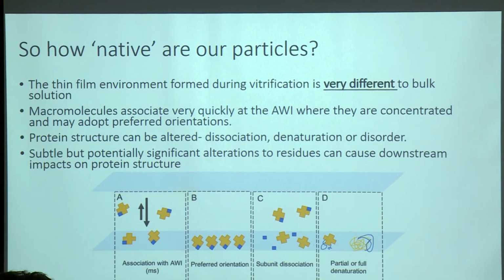And so far, our work to date has really only shown that there is a huge amount of variation on a protein by protein basis, which at least, for me, provides some comfort when I'm struggling to optimize a project, because it is a protein-specific thing in terms of its behavior, but there are lots of strategies that we can use to improve the prep.